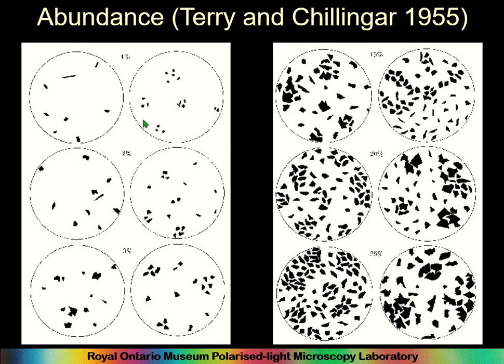These are accurate, they just don't seem very precise. He would look at these charts to make sure my data was more or less right, so we could pretend that precision was also accurate. So I thought, why on earth am I wasting my time? We should just do this. And that's the technique we use here at the ROM.